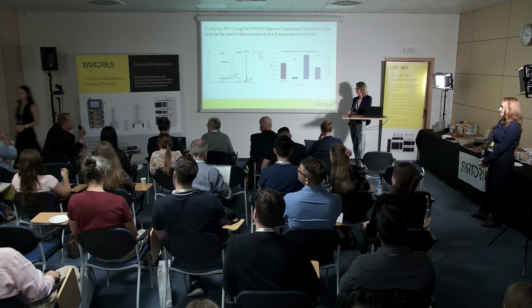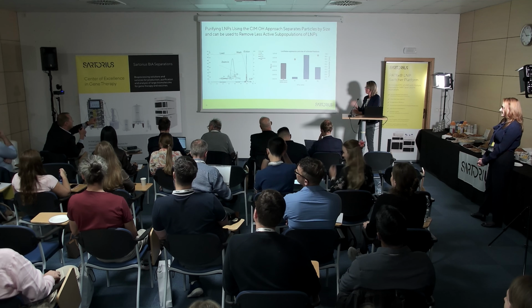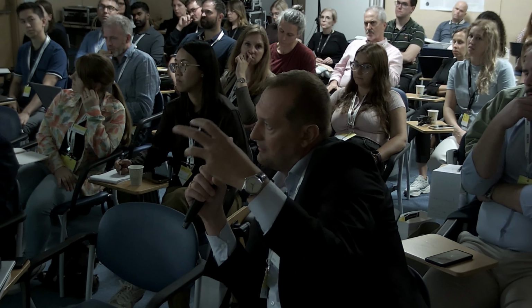A little bit on this topic, I have a question. If I understand you correctly, you had to compensate with the amount of mRNA if the mRNA concentration was lower for E6, for instance. So you added more particles, right? Exactly. Did you try to do a response curve to measure the potency at different concentrations? Because you might be saturating with the particles, you may saturate the entry simply.